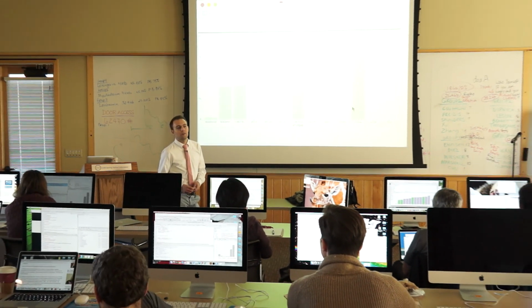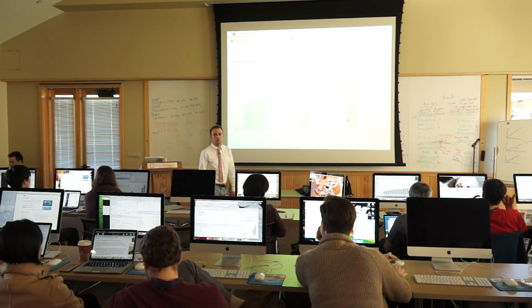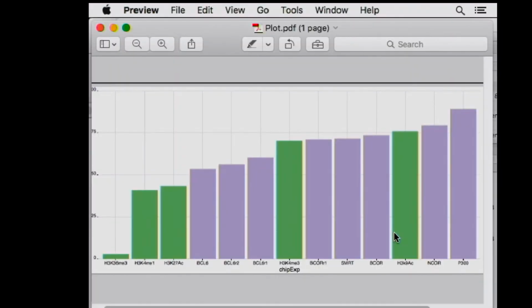In a way, I probably could have done that first, but Olivier mentioned how important it is to see the data. What do these overlaps look like? It'll give you a sense of what these overlaps mean. You could also pull up all those bed files in the ChIP-seq database folder and inspect what they look like. I didn't include the coverage tracks for the ChIP-seq, although you could download something similar in IGV. But if you load the BAM file, it will give you a coverage track.